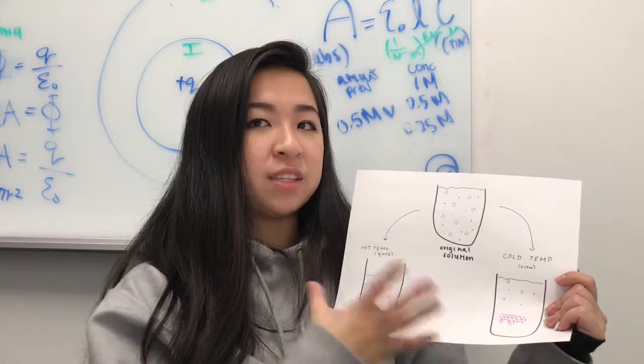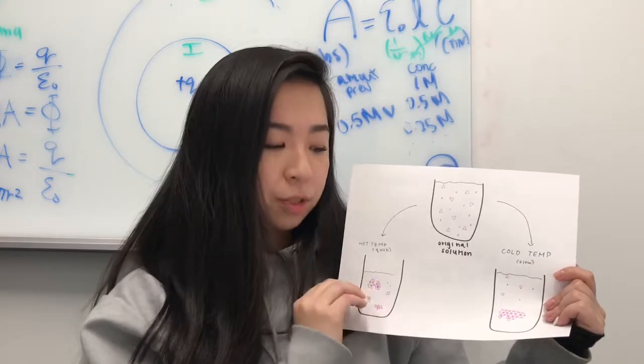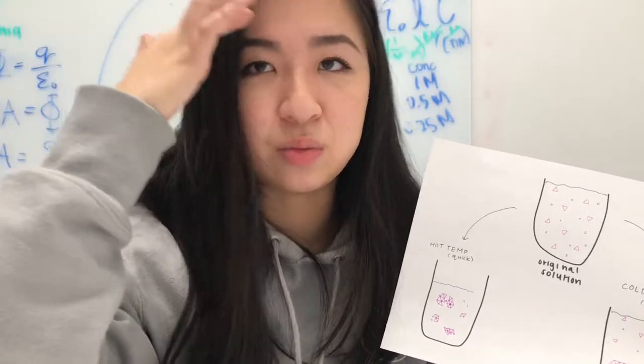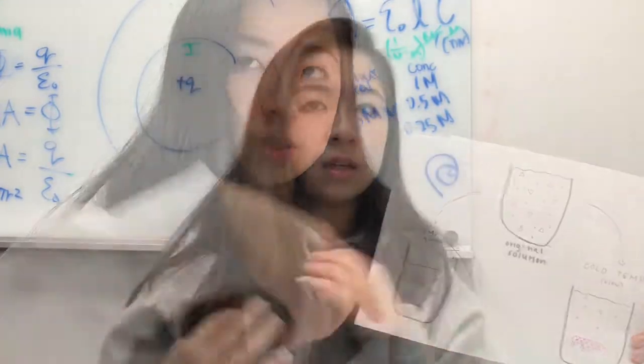However, if the same solution is grown in warmer temperatures compared to colder temperatures, the solution in warmer temperatures tends to grow faster, and also since evaporation is expedited, this is why the saturated salt solution mentioned previously was boiled.